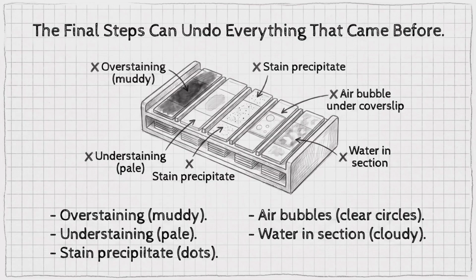Floaters, folds, chatter, or even just a poorly coverslipped slide can obscure crucial findings. Your meticulousness in these final stages directly impacts the pathologist's ability to make accurate conclusions. Every single slide you produce is a piece of evidence and it needs to be unimpeachable. So let's dive into some specific challenges you'll face.